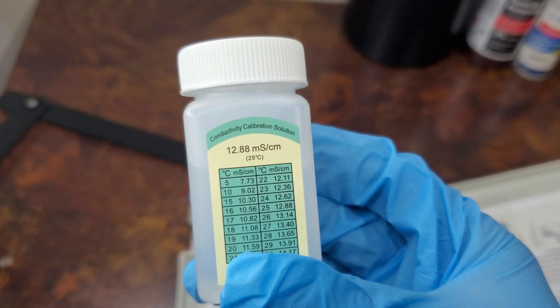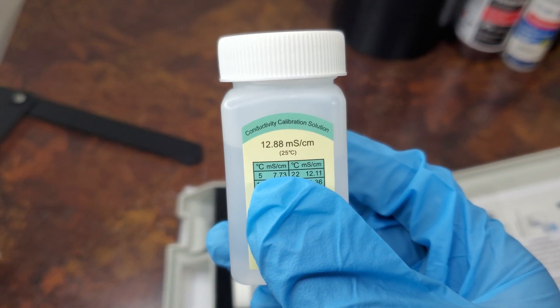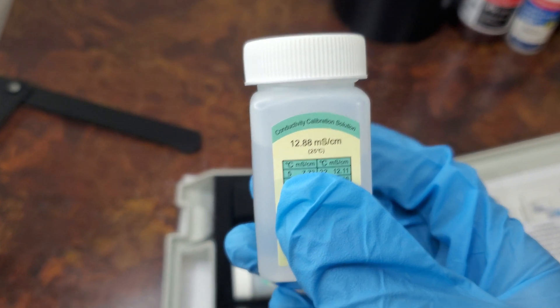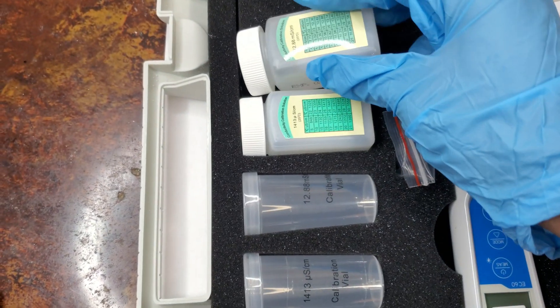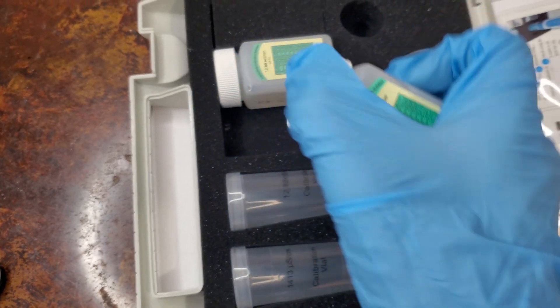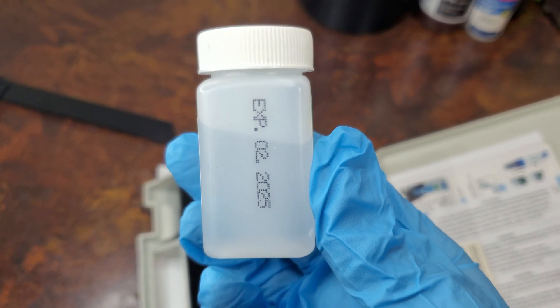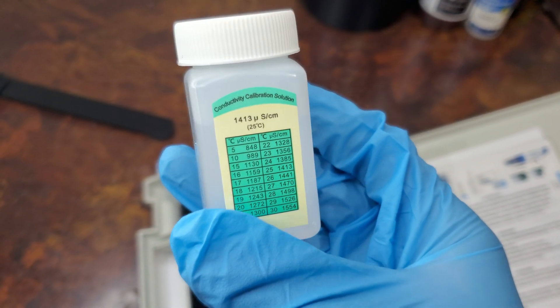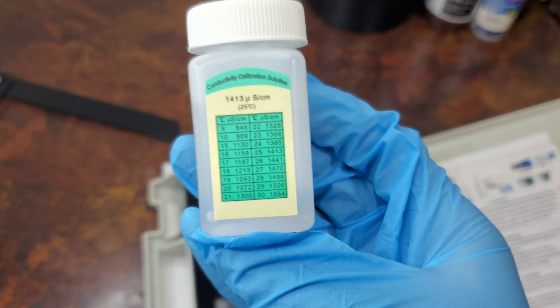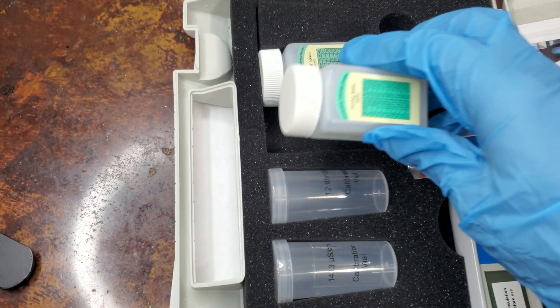Conductivity Calibration Solution for 12.88 mS/cm — this makes sure our device has a two-point calibration. Conductivity Calibration Solution for 1413 µS/cm — this makes sure the device has a one-point calibration.